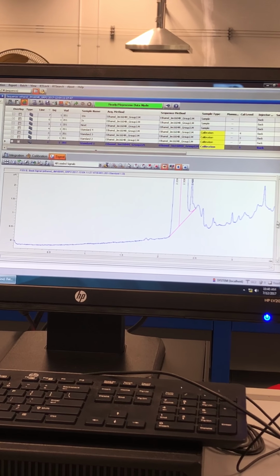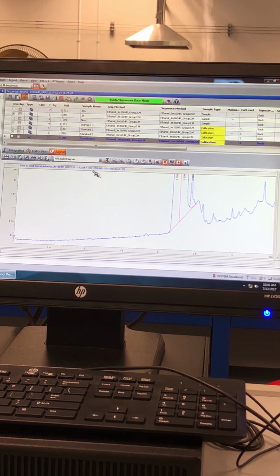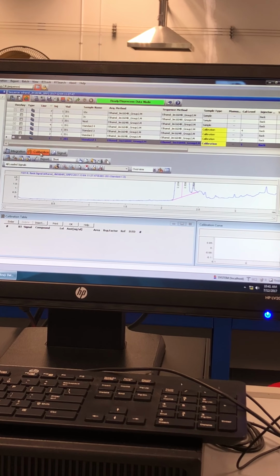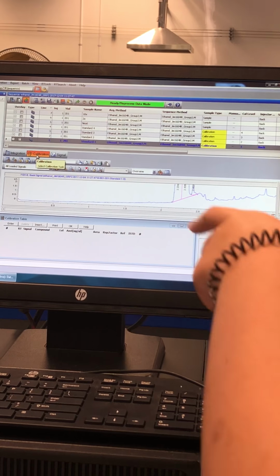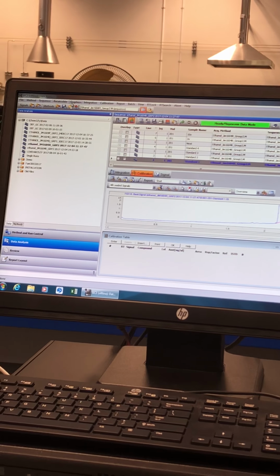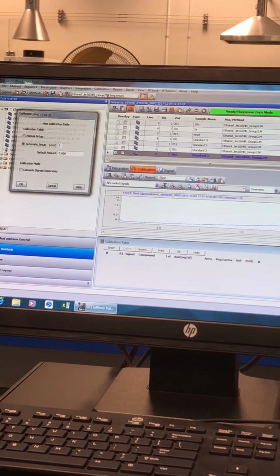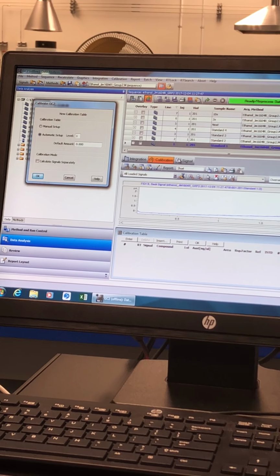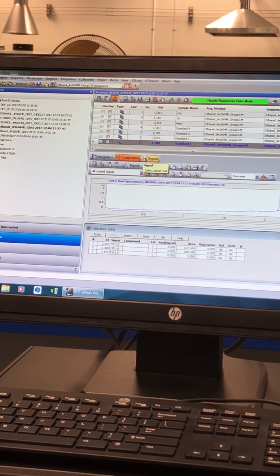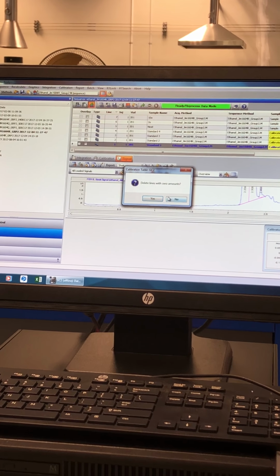Once you have done that, you will go to calibration, new table. At the top, there's this calibration word there. Calibration, new table. After you've done that, click OK. There's a pop-up window, you just click OK. After you click OK, at the bottom a table will appear, right?